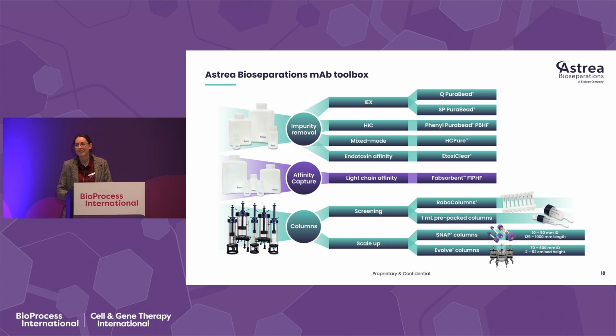Great talk, Caroline. Thank you. Just with your HC Pure product, if I've got this right, HCP and viral selectivity are tunable, right? Tunable, yeah. So that means that you can operate across a wide range of expression systems when the conditions are optimized. Yes, that's the take home.